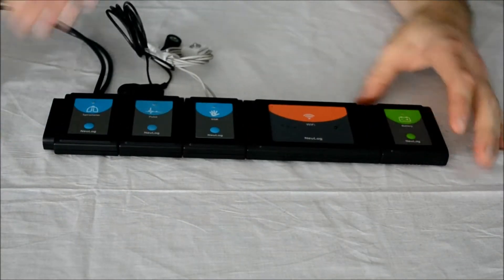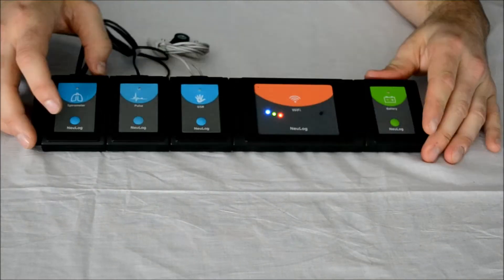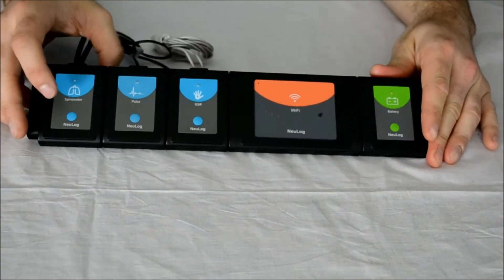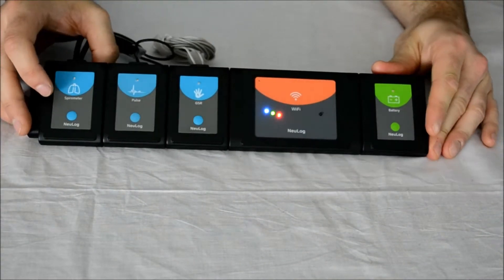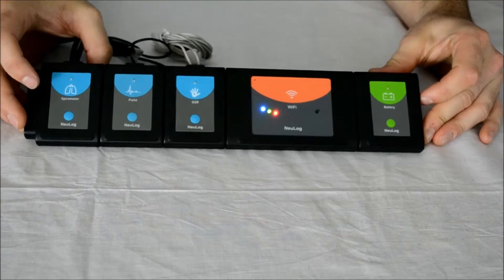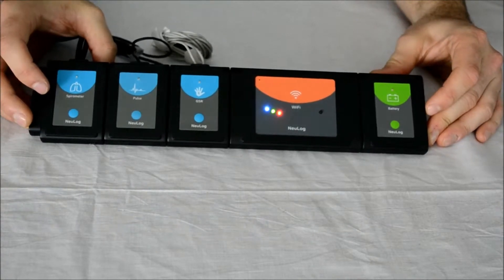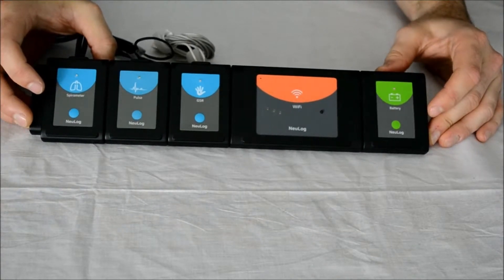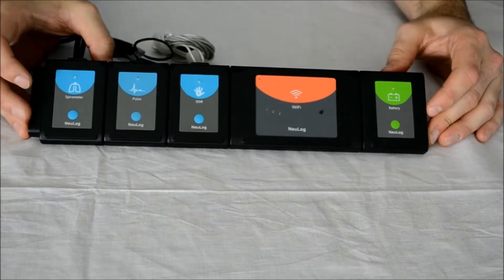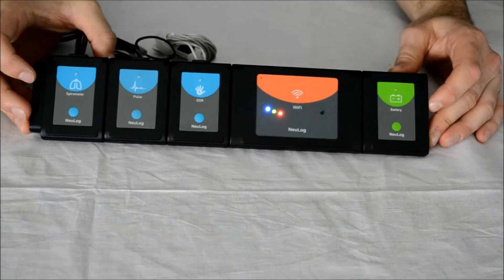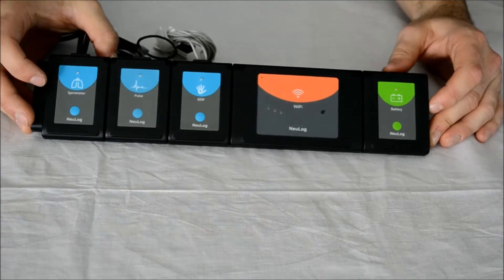When only the blue light remains on, your network will be wirelessly transmitted and you can connect any device to it. This is generally done through your device's settings or wireless settings option.